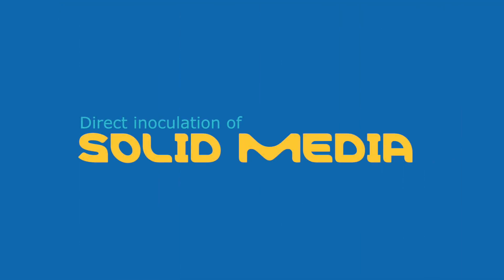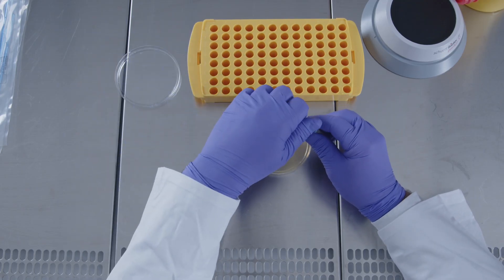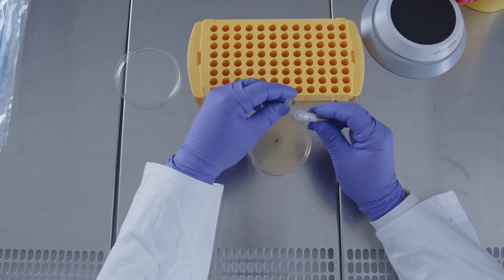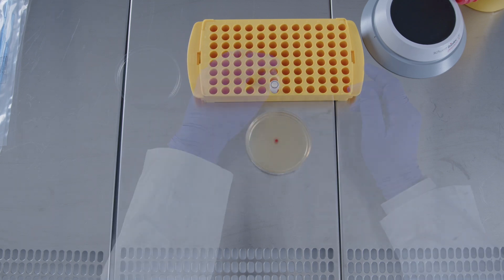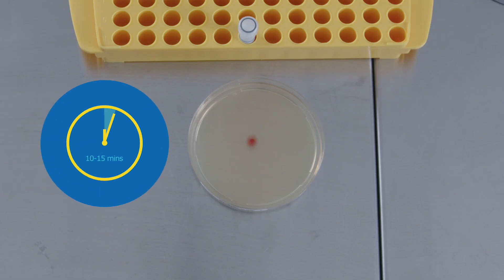The discs can be used to directly inoculate solid media. Open the vial and drop the disc onto the agar plate. Close the plate and leave at room temperature for the disc to rehydrate. After 10 to 15 minutes, check that it has fully dissolved, leaving only a drop.